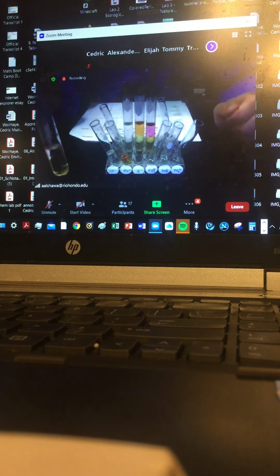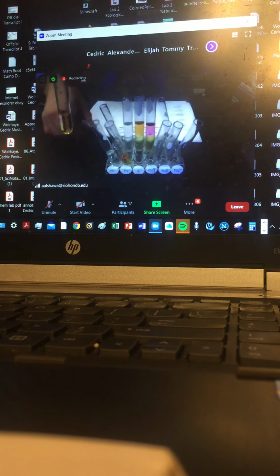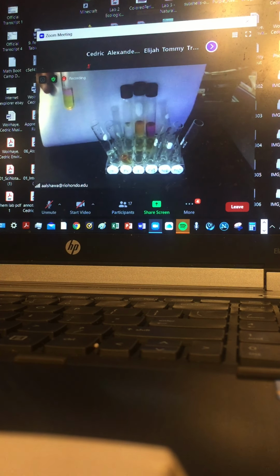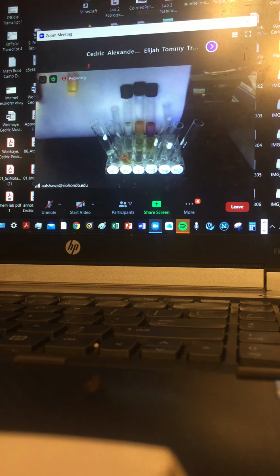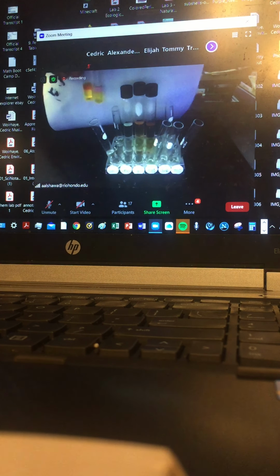This is what I got as far as the addition. I don't know if you can tell them apart. So this is the background. Do you see that pinkish background? It's sort of too faint, but can you tell it? Can you see it? Yes. You see that pink background? So I can compare it with that rusty orange background.